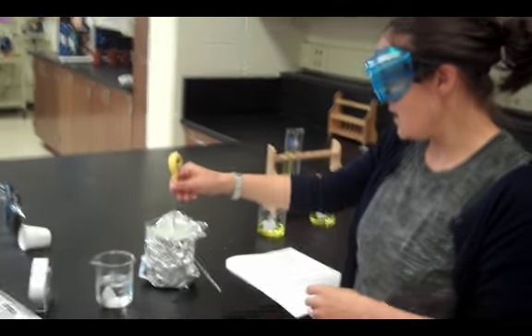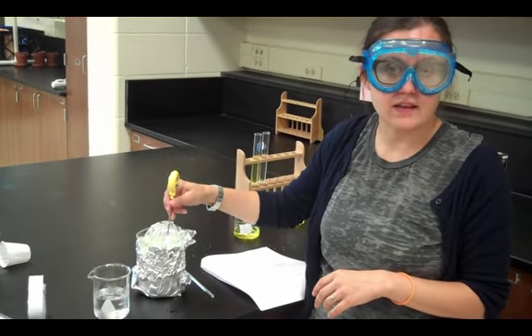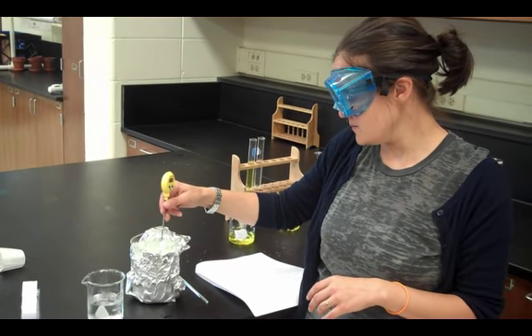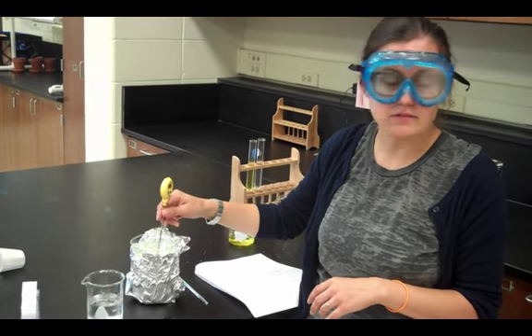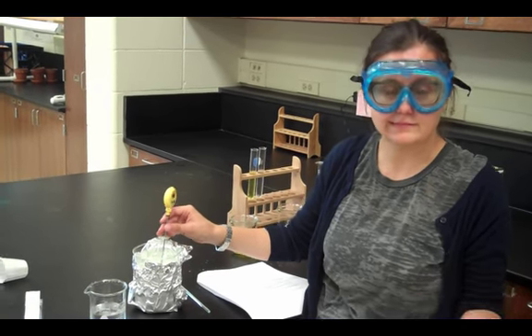Thermometer. Every 30 seconds, record the temperature until you see ice crystals, and then 6 values beyond, and until it is completely frozen. Don't forget to add a small piece of ice so you don't have any supercooling. Great.